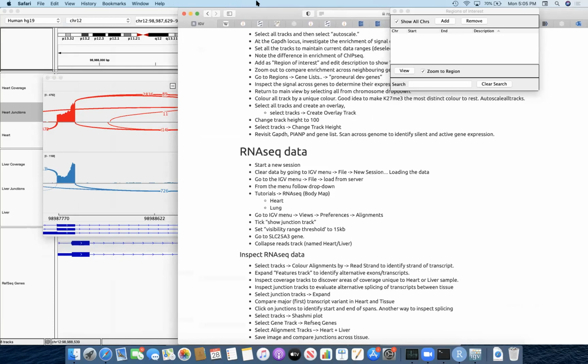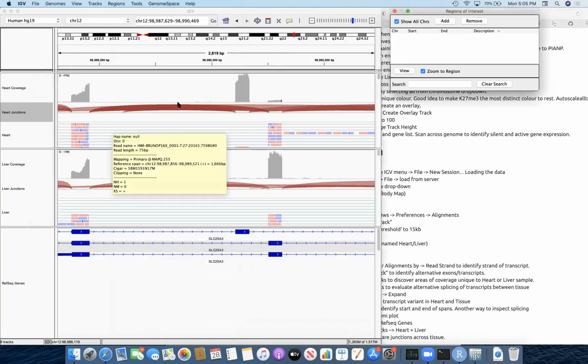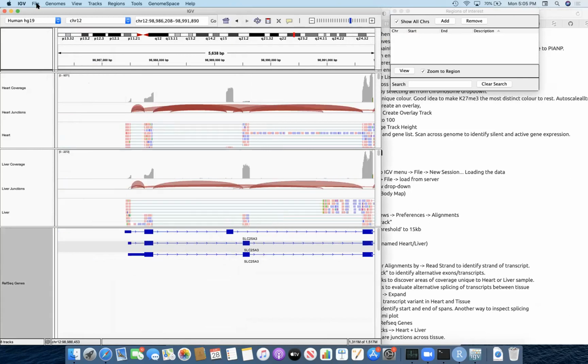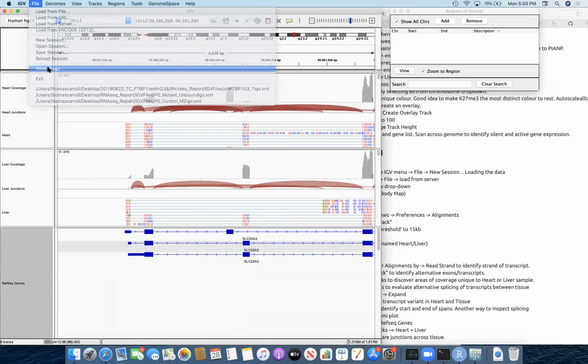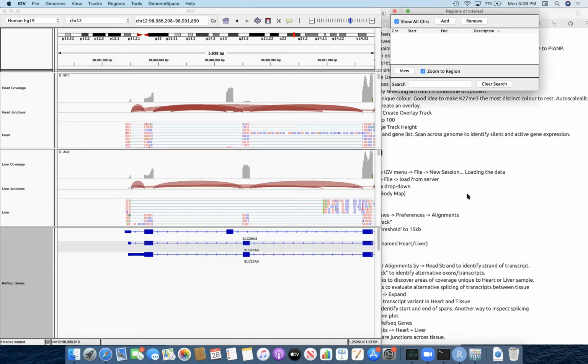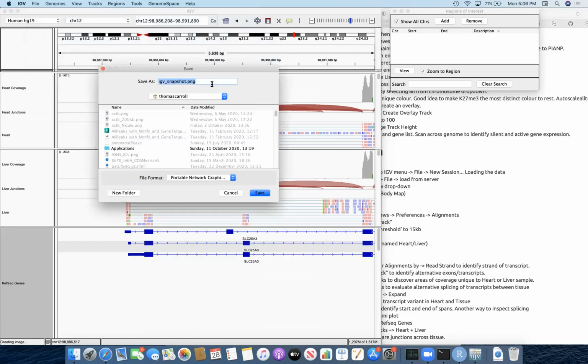Okay, select gene track. We did that, and then we just save this image. I think it was this one, select gene track. Select that. And I think the last thing we wanted to do is just go File, Save Image. I got an alarm beeping at me in the background too. Oh, sorry. Actually, most of all, you're going to want to save that not as a PNG. You're going to want to save that as an SVG. So you can save that.